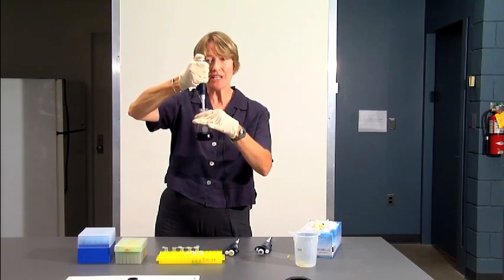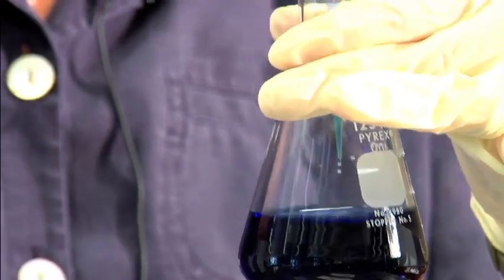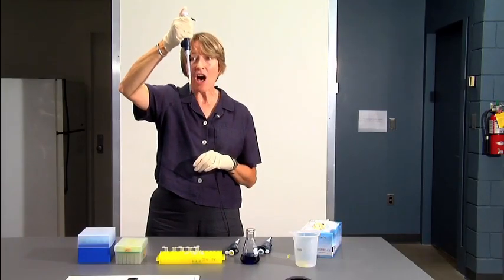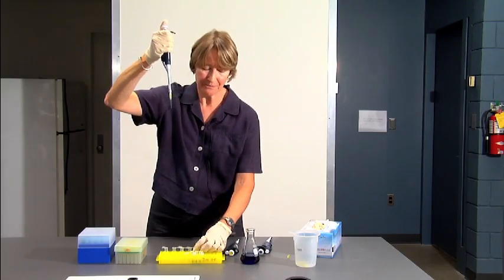So I pushed down the plunger to the first stop. My pipette tip is under the surface of the fluid. I'm now going to slowly release the plunger and pull my sample up into my pipette tip. I now have 100 microliters of accurately measured sample in my pipette tip.